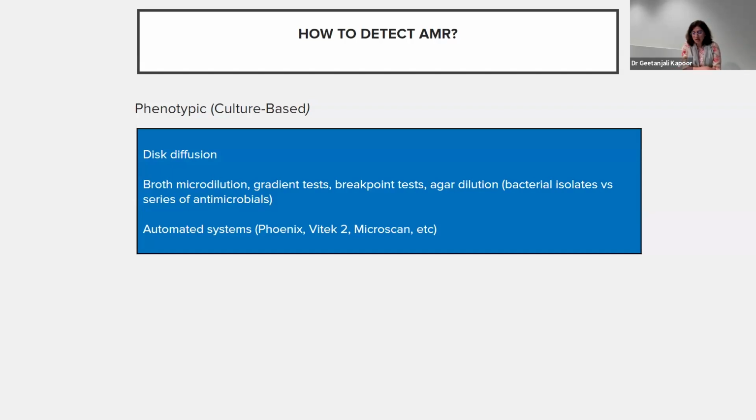You put that on your culture plate, leave it overnight, and look for where the zones of inhibition are happening and what the radius of each zone is. This is basically a fight between the bacteria and the drug. That is the meaning of disk diffusion. The antibiotic from the disk diffuses out overnight, and the bacterial lawn on the plate becomes a war between these two.